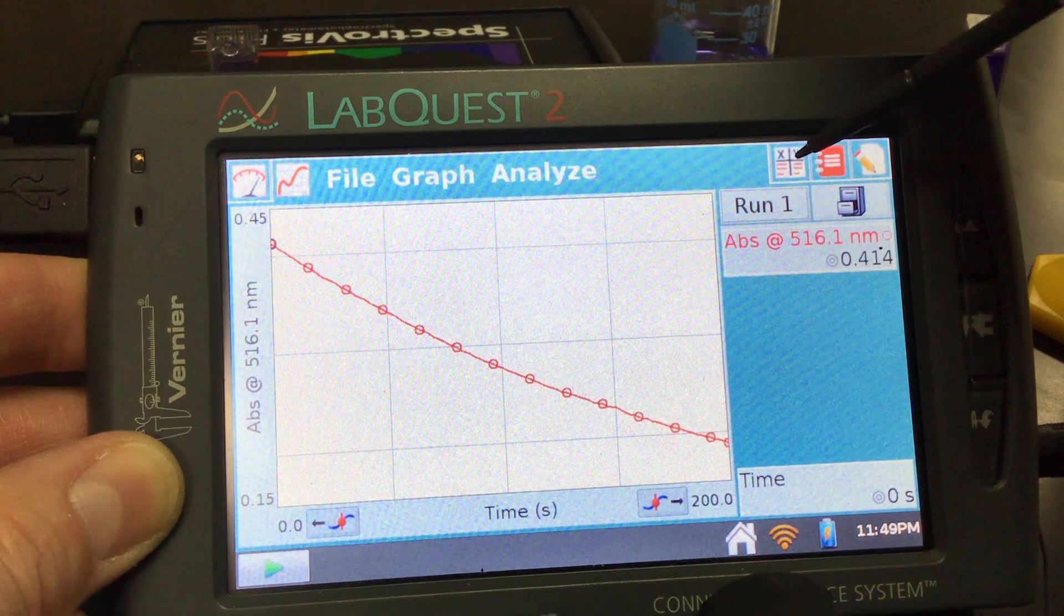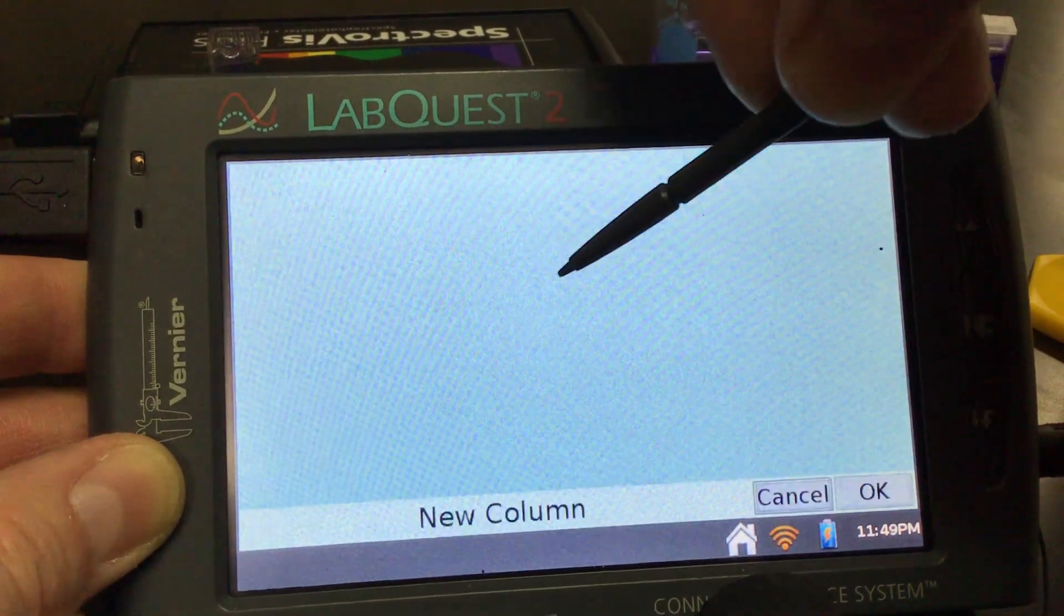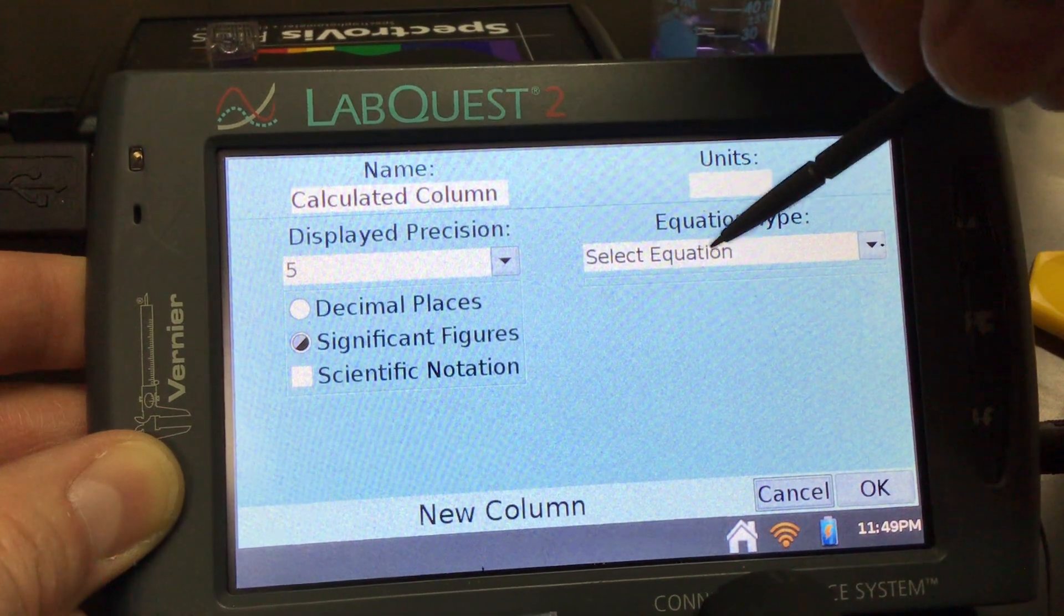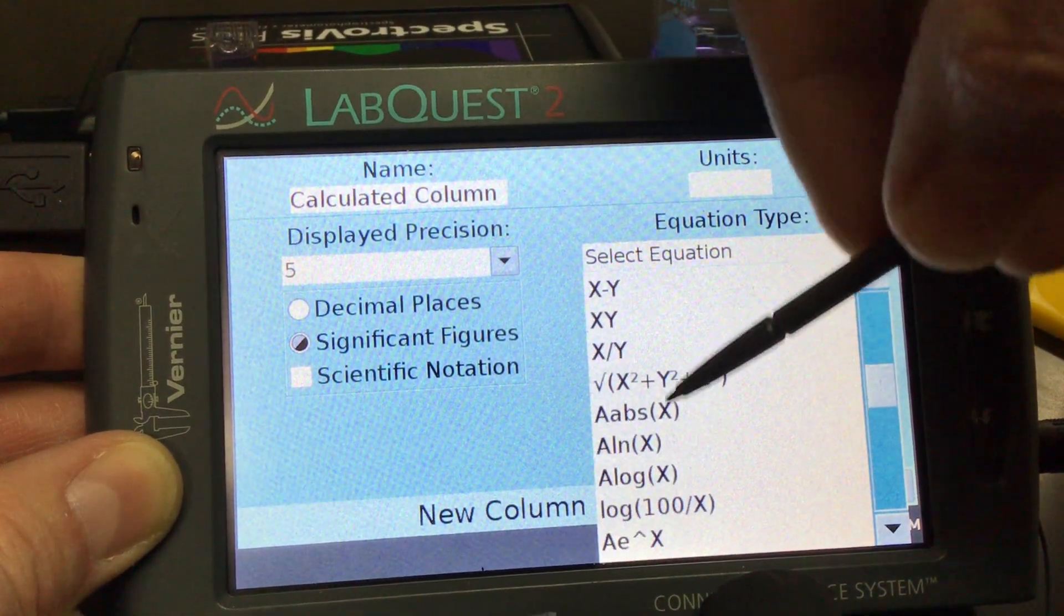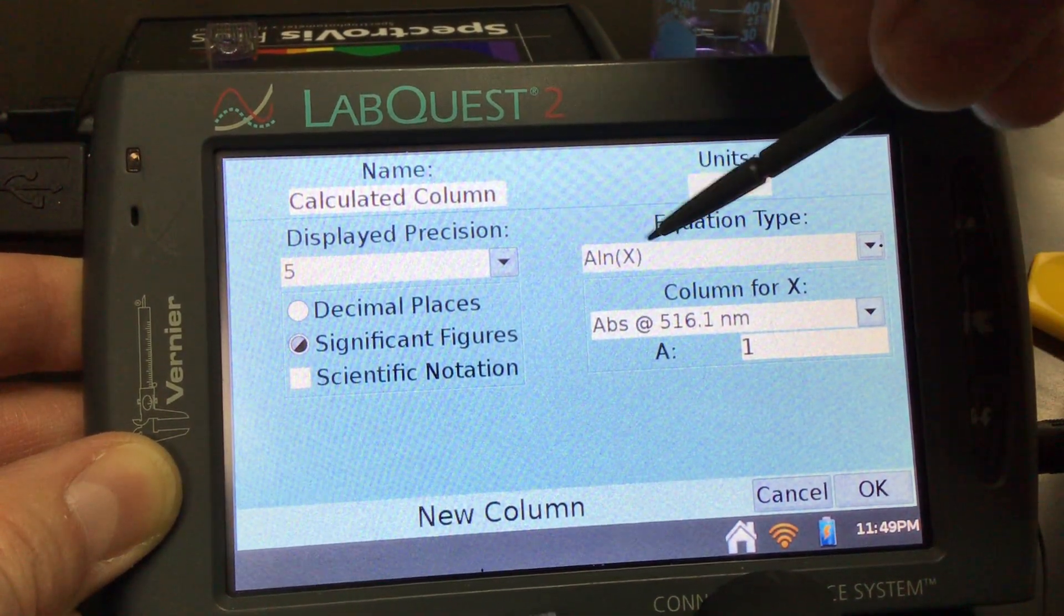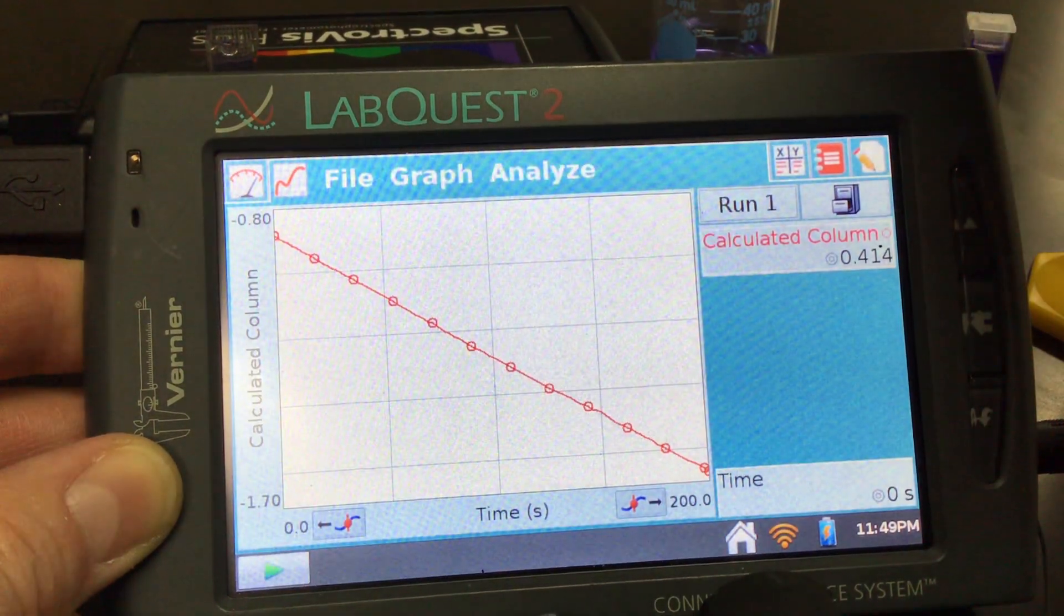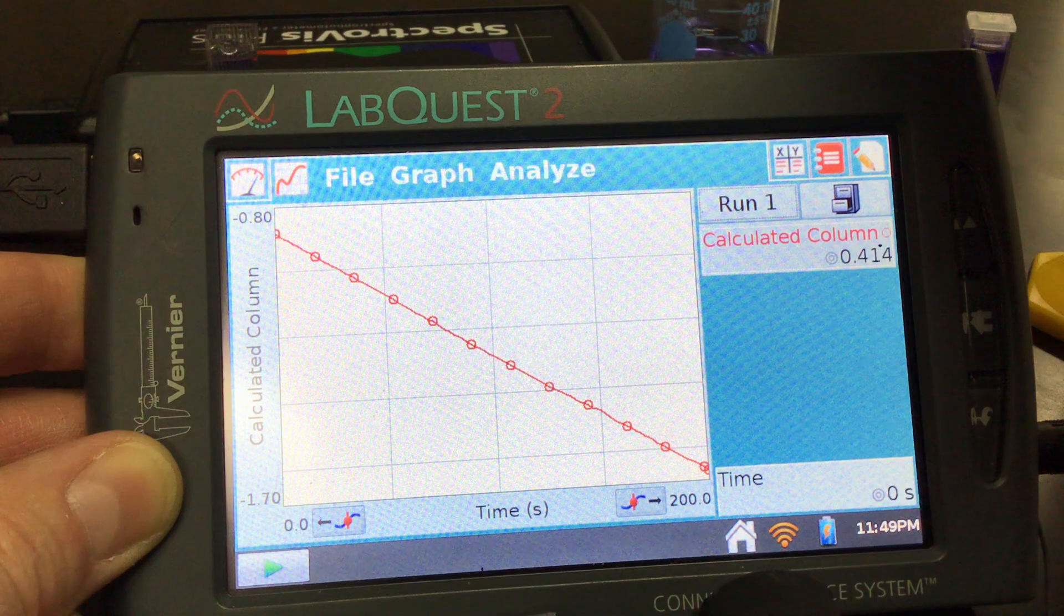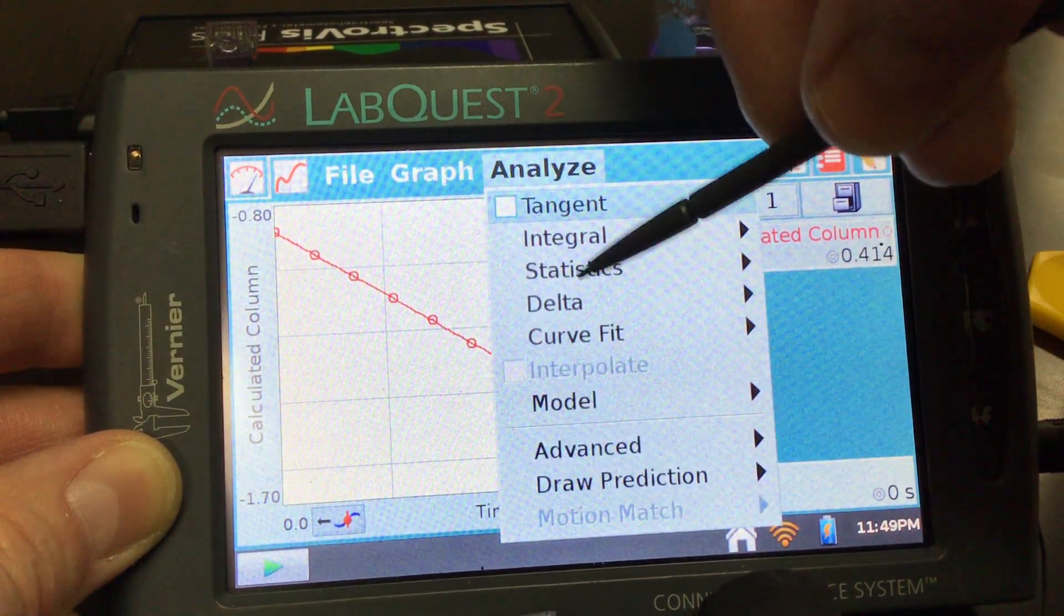We're going to go into our table on the top right and we're going to create a new calculated column. We're going to tell it to do the natural log of absorbance to see if we have... the natural log of our absorbance here. That's going to tell us if it's linear. Yeah, it looks very, very linear there.